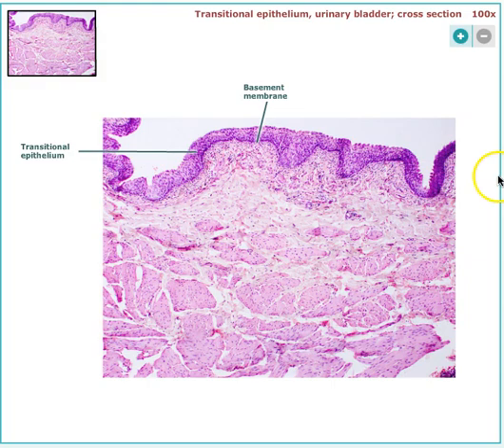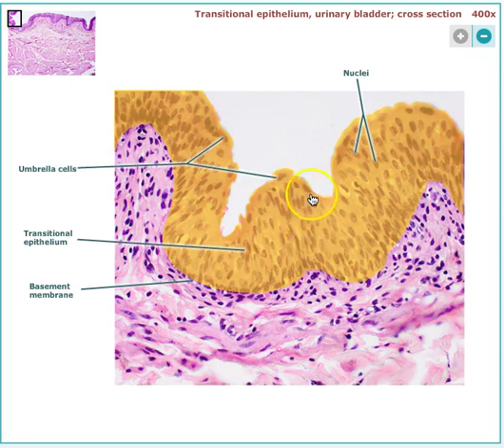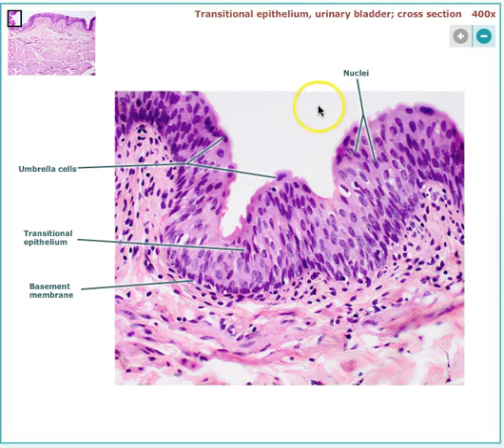Transitional epithelium, we're on lower magnification here. So the arrangement of the transitional epithelium, you'll notice that, as I said in class, this looks like a dog pile of cells, essentially. Some of the cells seem more square, more rectangular. They're laying on top of each other. And that's because they're designed to stretch out. They're designed for distension. Okay, you see these umbrella cells sitting up here. And this is a telltale sign that you're looking at transitional epithelium, and you find this in the urinary bladder, and this tissue pattern is very, very effective for distension.